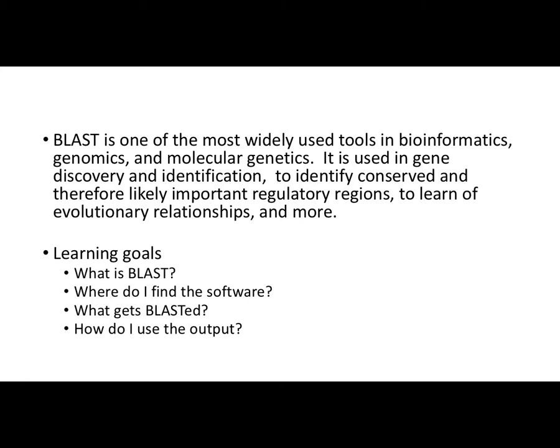It's used in gene discovery, gene identification. That's where you're going to be using it, used to identify conserved and therefore likely important regulatory regions. You may be doing that in some of your independent studies toward the end of the semester, and a variety of other things. So what I want to do today is just give you a sense of what is BLAST, where do you find the software, what gets blasted in terms of what you're going to be working with, and how do you use the output.